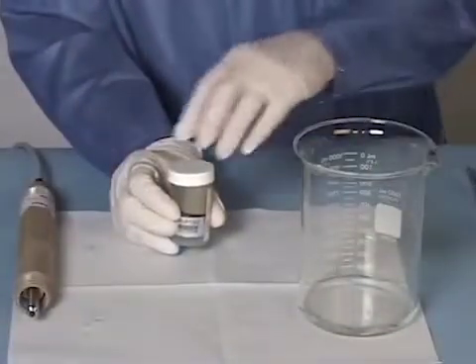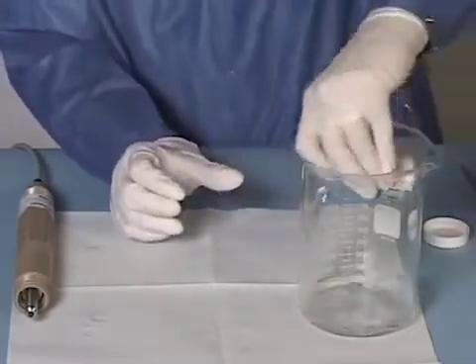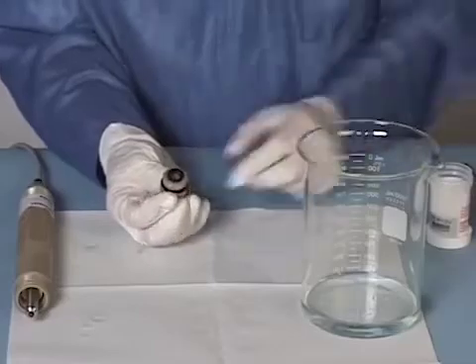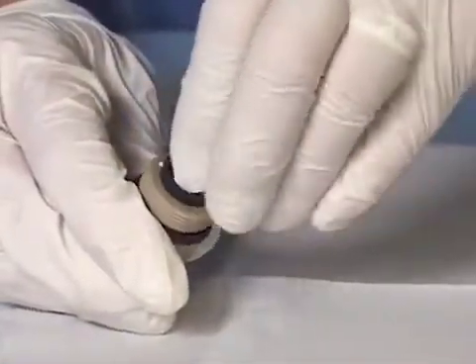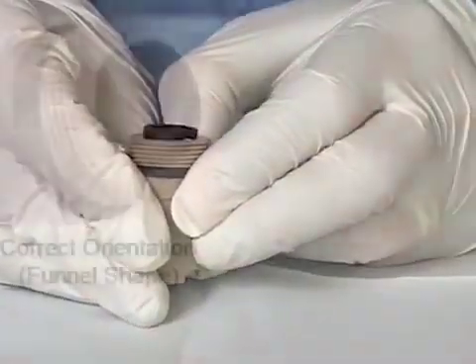To remove the new salt bridge from the container, first drain the storage solution, then drop the salt bridge into your hand. You will want to locate the inner gasket — it should be in the salt bridge but may have come out in shipping and may remain in the container. If the gasket did come out, simply replace it into the salt bridge recess, making sure to fully set the gasket into place. Note that the inner gasket seats into the salt bridge grooves.